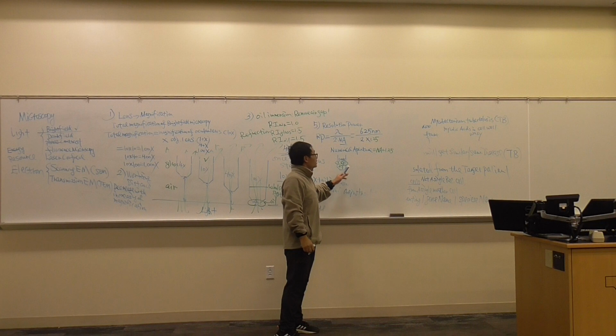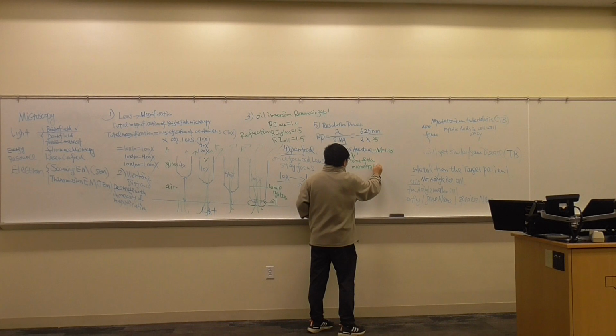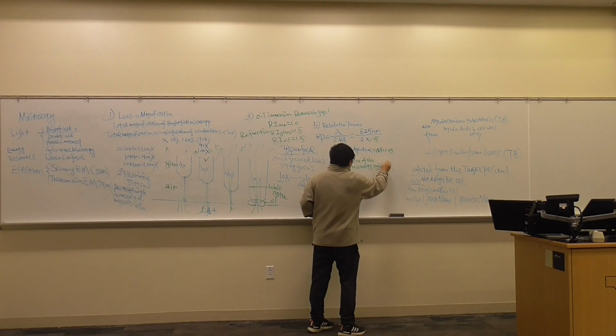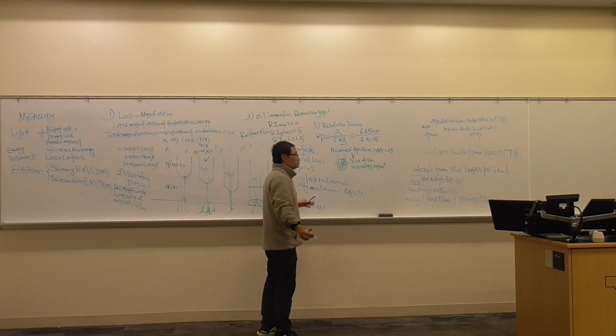And I always say numerical aperture is like the size of the microscope engine, like the size of the car engine.